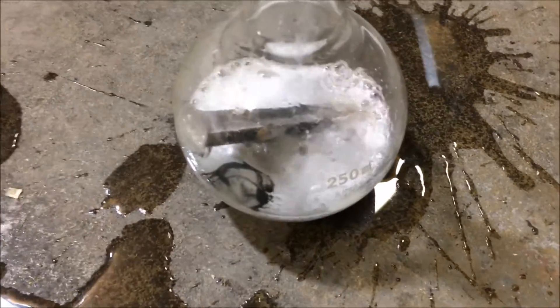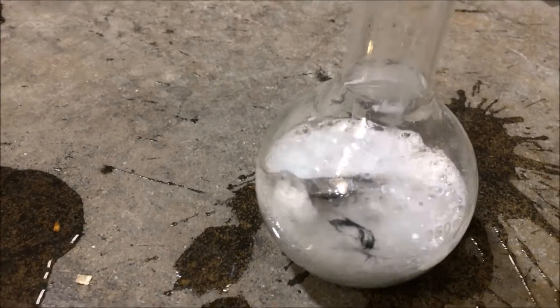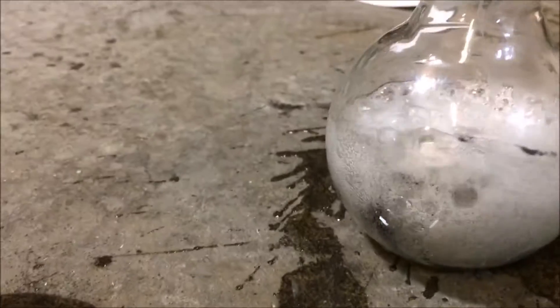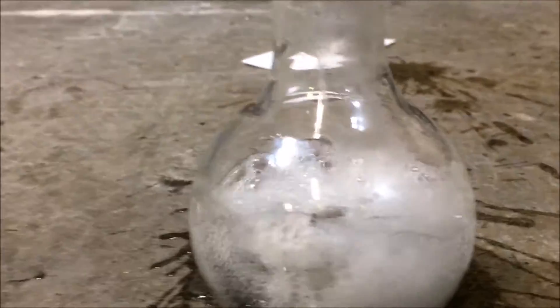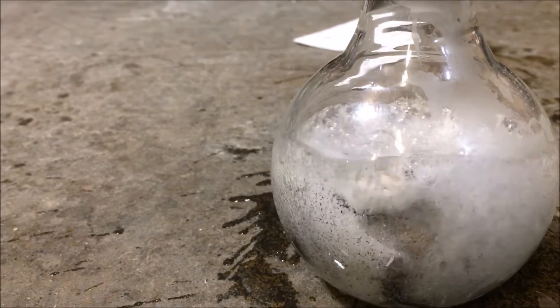I suspect the reaction just went thermonuclear on me. I had to hurry up and throw it down on the ground — I can't even touch it. At about 48 minutes into it, it just went completely nuts and it still is. The hydrogen production at this point is pretty brutal. As soon as the bubbles hit that neck, they just go crazy and shoot out of that thing like a geyser.